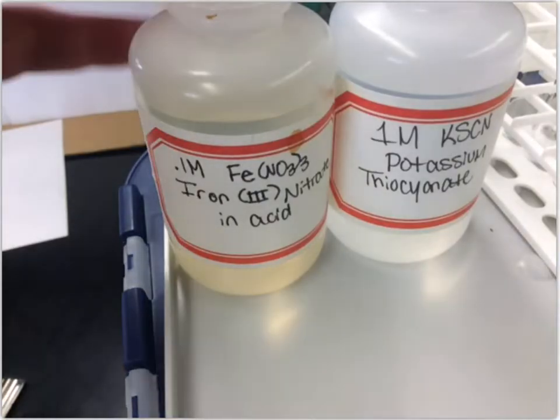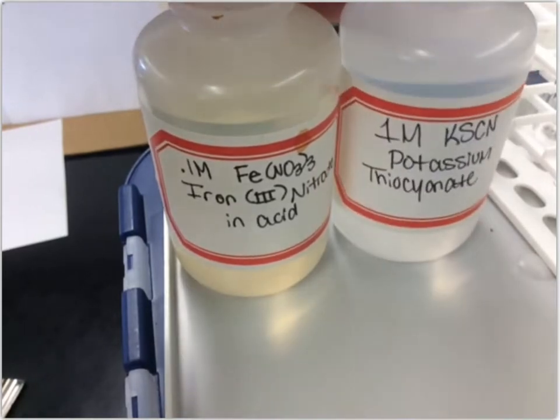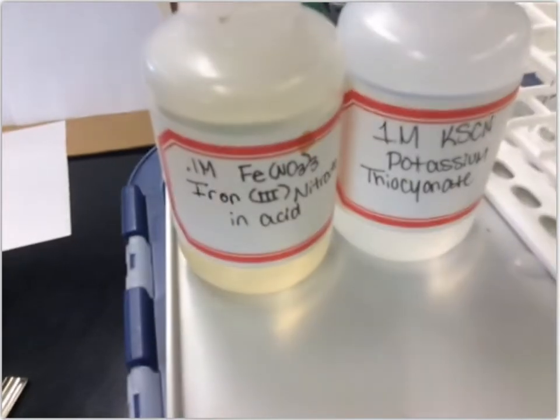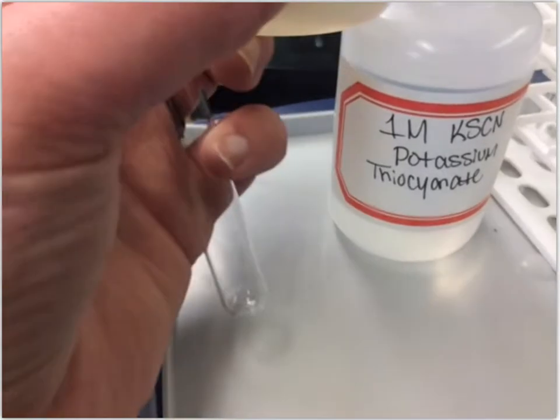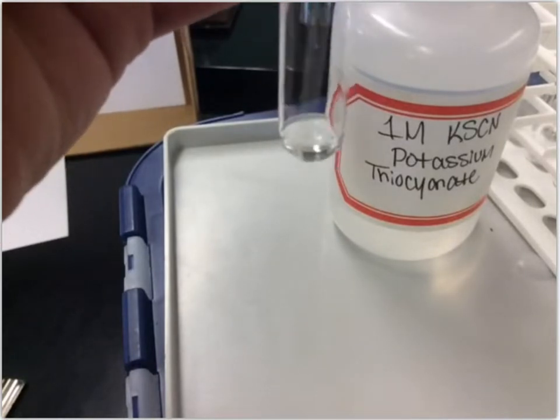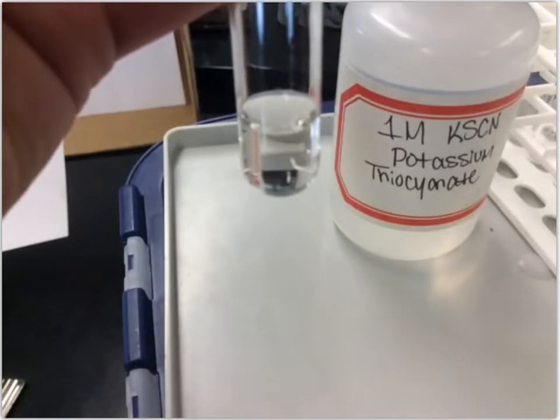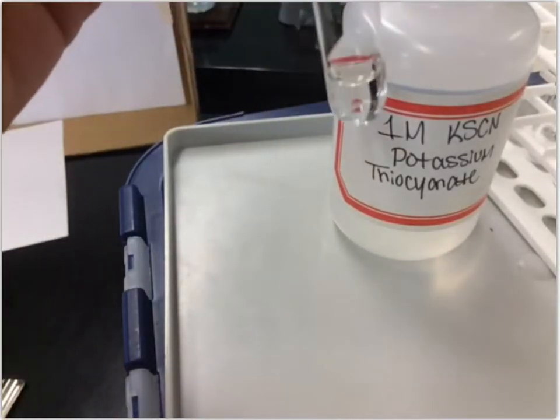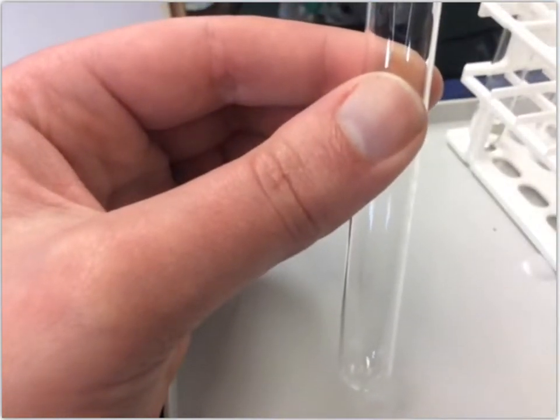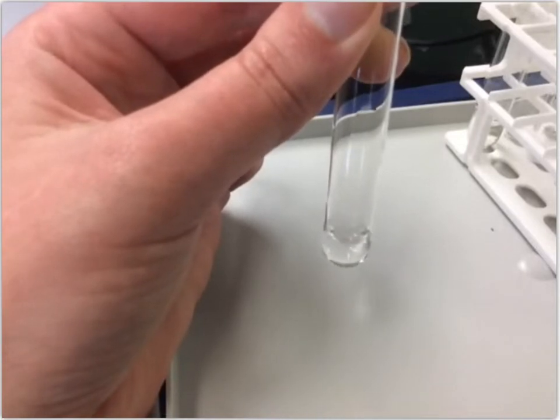The next reaction is between iron(III) nitrate — Fe(NO₃)₃ — and potassium thiocyanate — KSCN. I'm going to take a test tube and put about a milliliter of the iron(III) nitrate in, filling it to about a centimeter deep. Then I'll get another test tube and put about a milliliter of the potassium thiocyanate in.